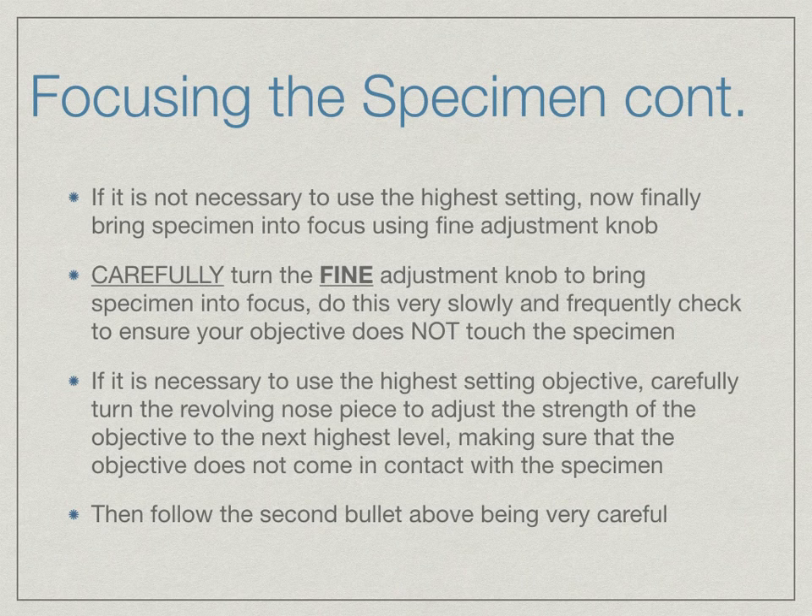If it is necessary to use the highest setting objective, carefully turn the revolving nose piece to that level, making sure the objective does not come in contact with the specimen. Then carefully turn the fine adjustment knob to bring the specimen into focus. Do this slowly and check even more frequently to ensure your objective is not touching the specimen. If you are working with partners, your partner can help verify that your fine adjustment knob is moving in the correct direction and that your objective is not coming in contact with the specimen or the slide.